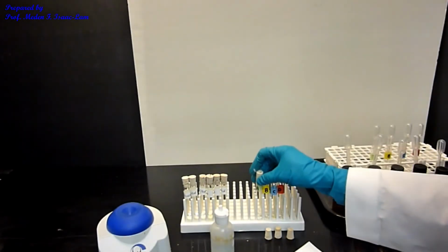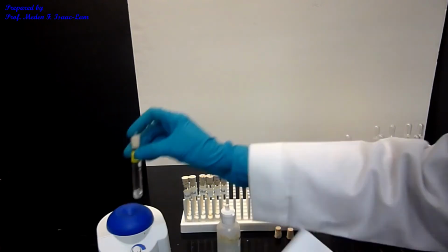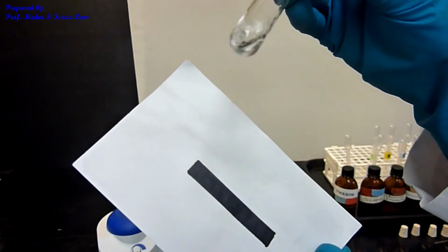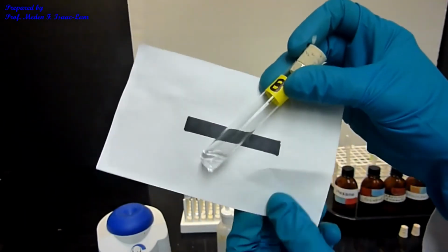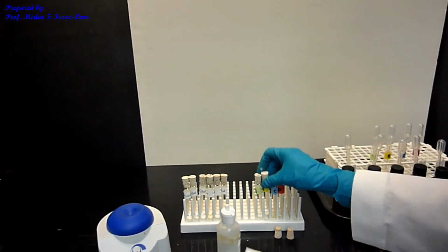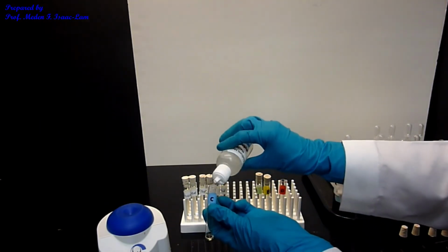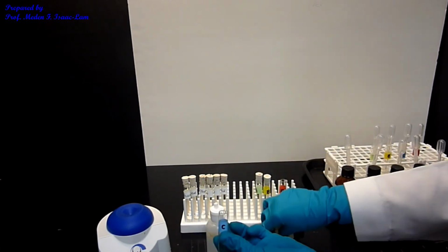Okay, and then we're gonna do B, vortex. I see some droplets or some separation. So you can see some separation of the layer. Okay. And now C. Mix it up.